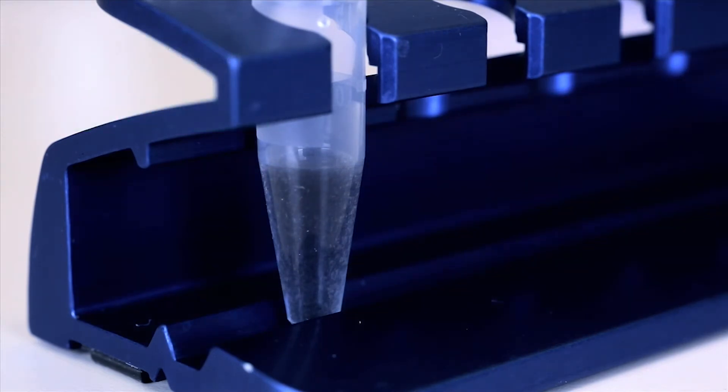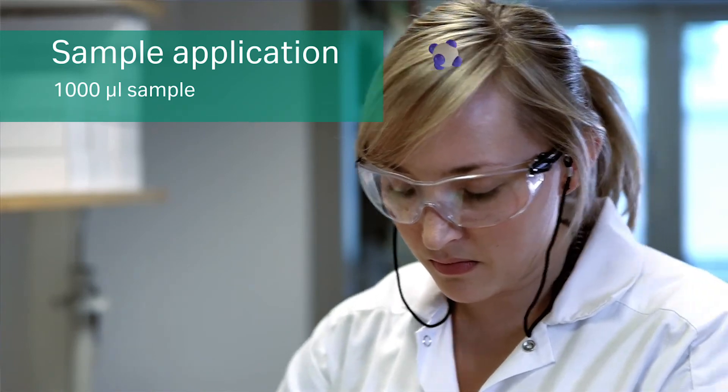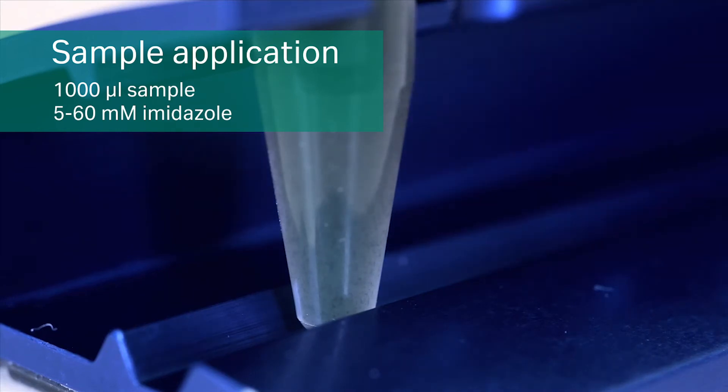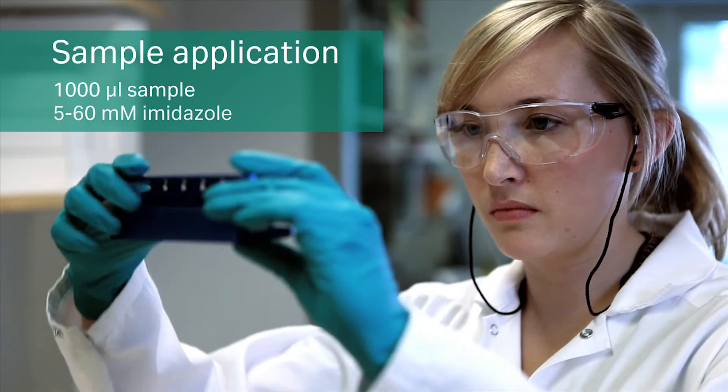Immediately after equilibration, add 1,000 microliters of sample containing 5 to 60 millimolar imidazole. If the sample volume is less than 1,000 microliters, dilute the sample to 1,000 microliters with binding buffer.